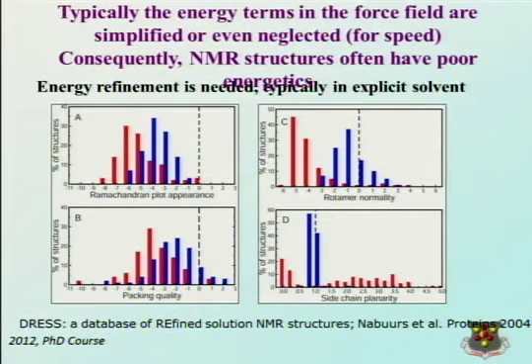I will go into slightly more detail shortly. If you take the Ramachandran plot appearance, which is probably known to all of us who are checking protein structures, you know that your amino acid backbone should be adopting given conformations, which are represented by the Ramachandran plot.